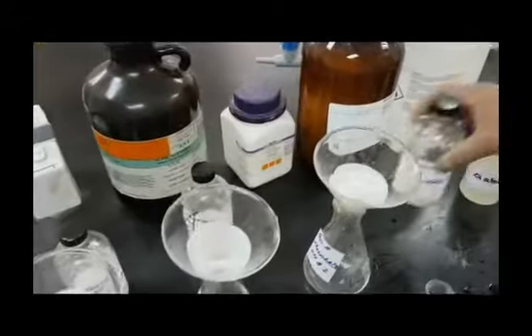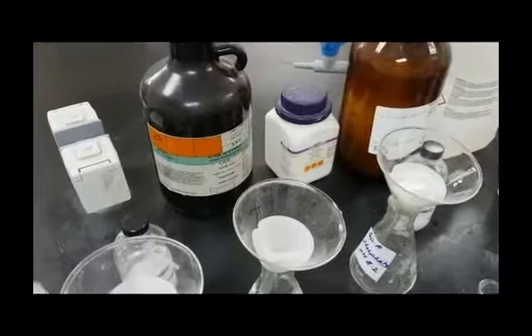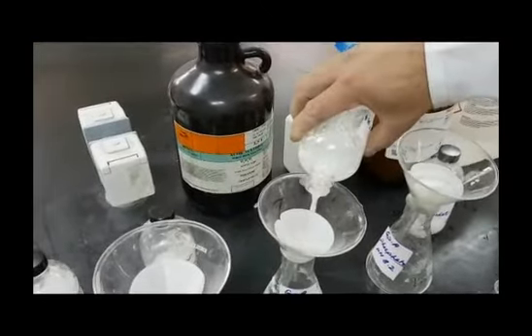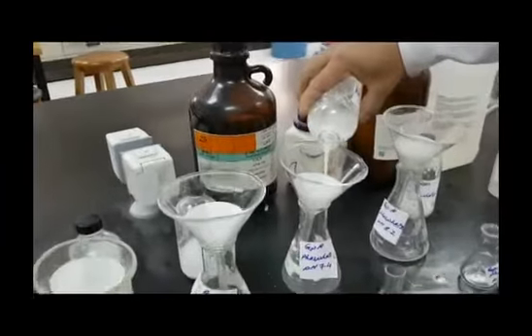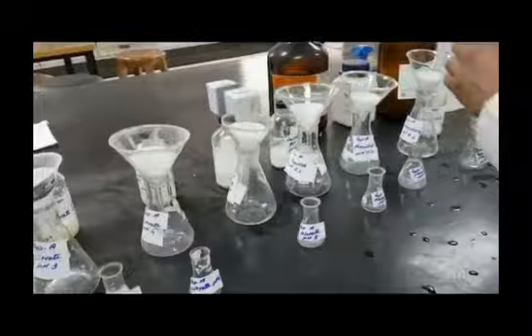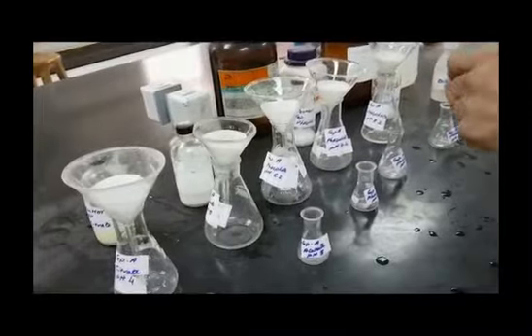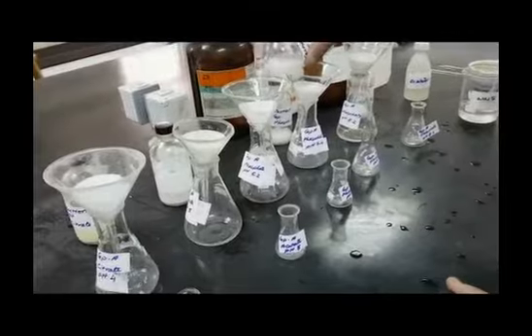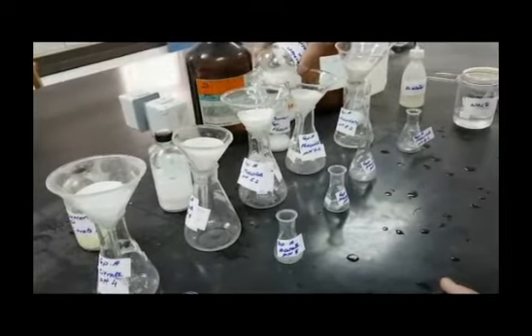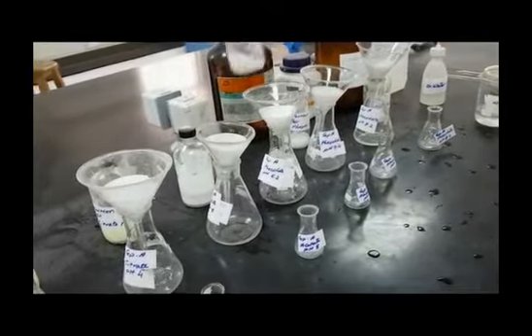The poured amount or volume should be controlled carefully. You should never reach the side or the limit of the filter paper, since this will create problems, as the unfiltered solutions or particles may leak out from behind the filter paper, leading to turbid solutions.